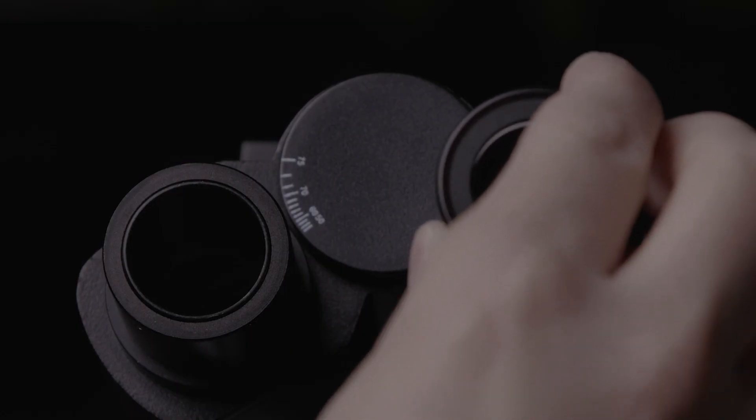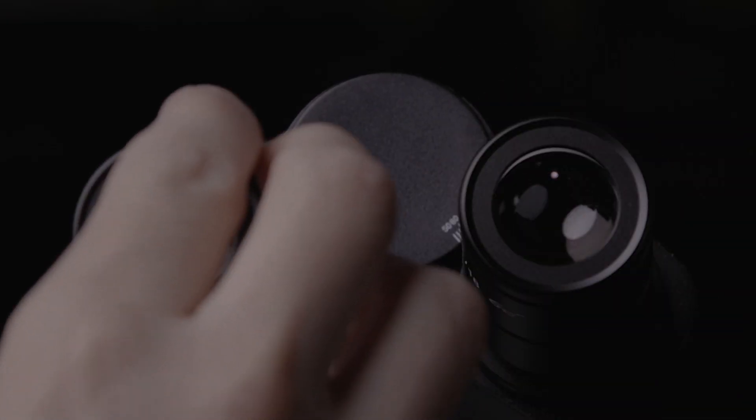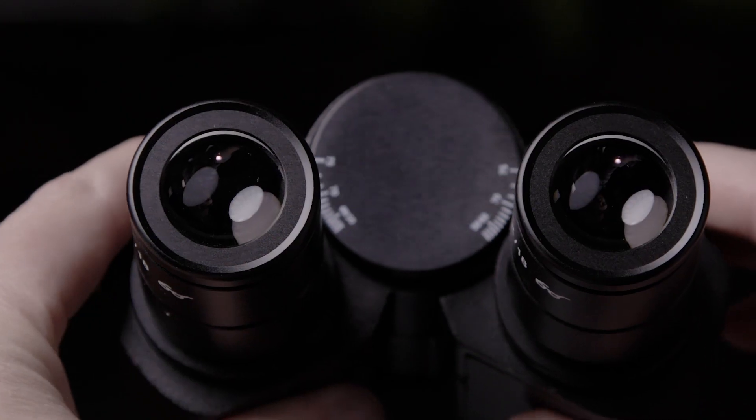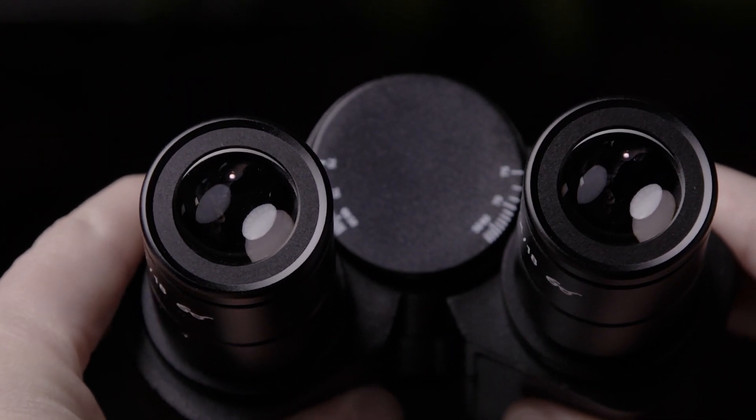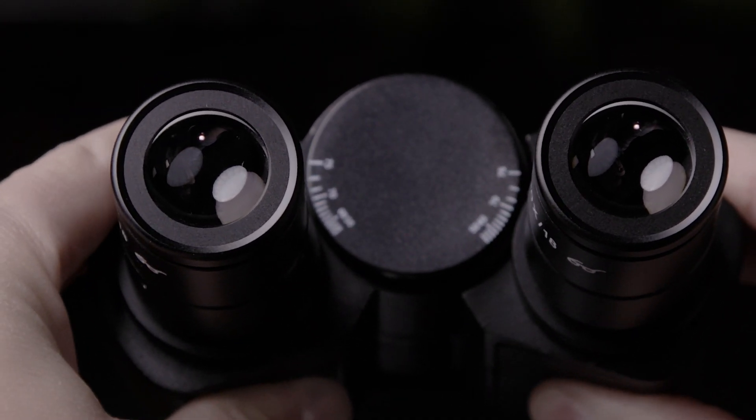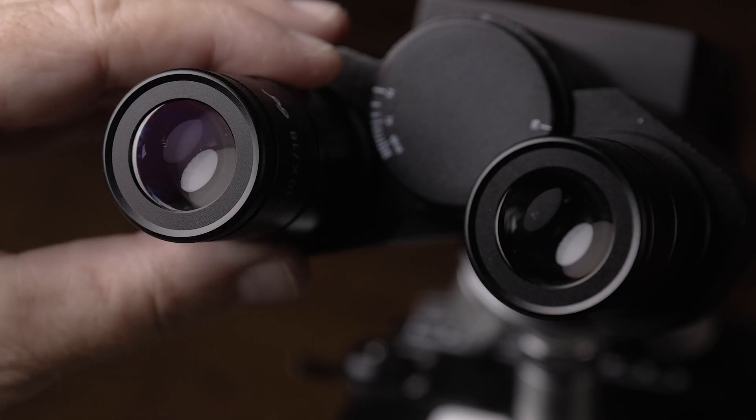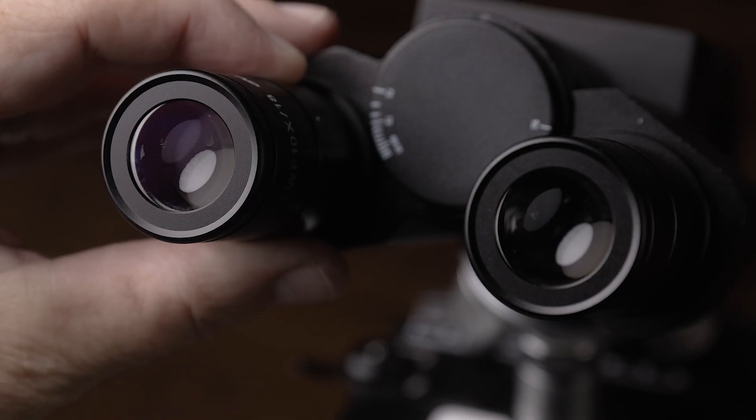If you have a binocular type, you insert both of them like this. You can adjust the distance between the eyepieces for your eyes by rotating the two tubes together, and you can use the diopter knob to adjust the focus balance between the two tubes.